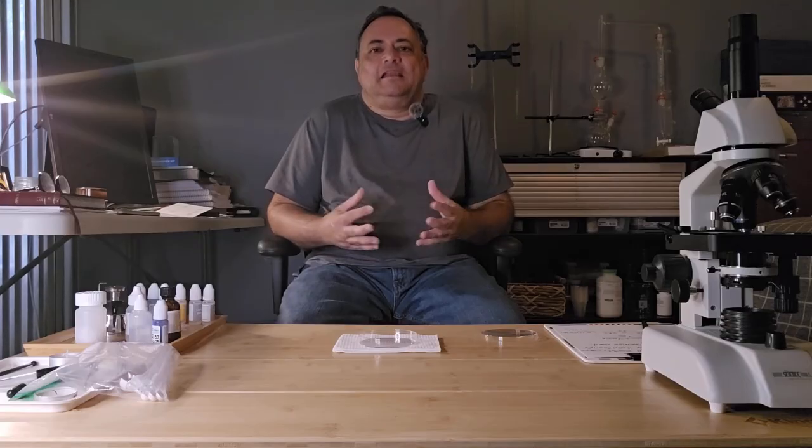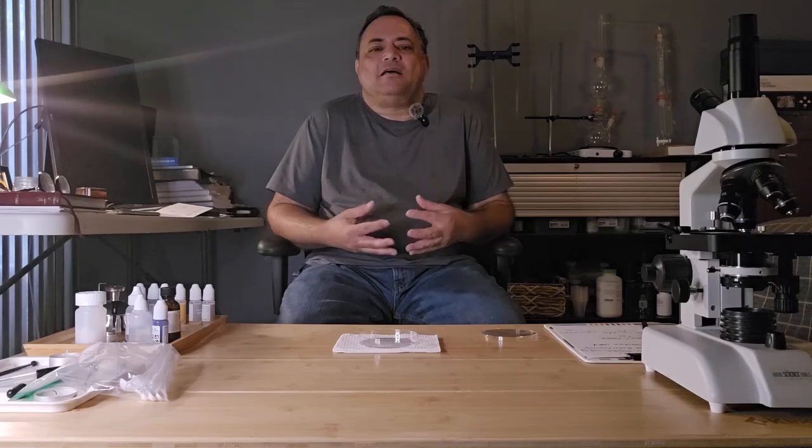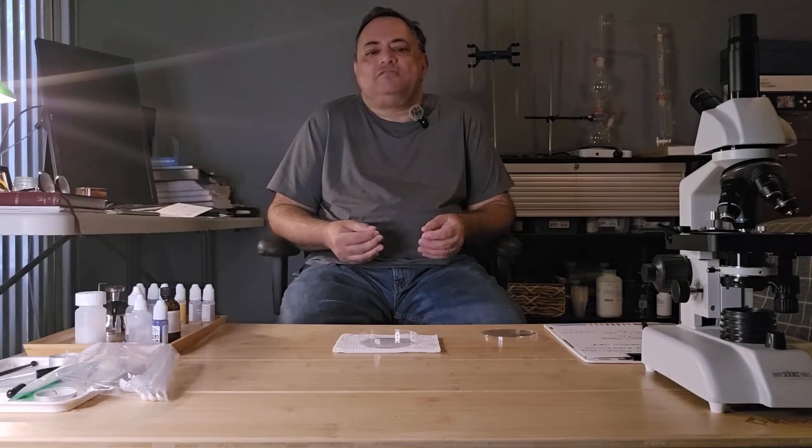Hello, everybody. Welcome to another episode of Science Abounds Home Lab Science. In today's video, we're going to be demonstrating an example of an ion exchange reaction. The ion exchange reaction between sodium silicate, also known as liquid glass, and metal salts involves the exchange of cations from the salt with sodium ions in the sodium silicate, resulting in the formation of metal silicates and the release of sodium ions in solution.